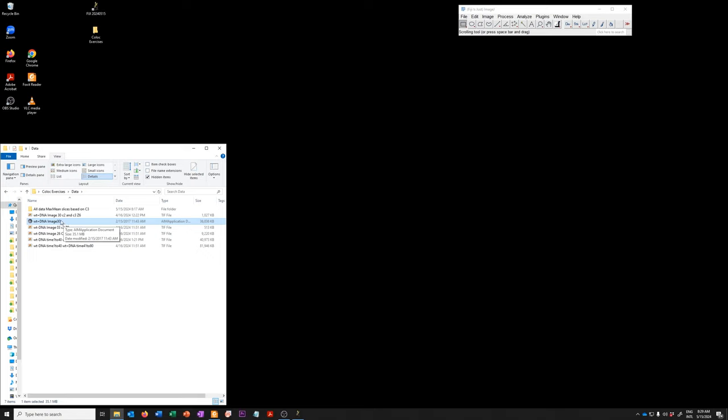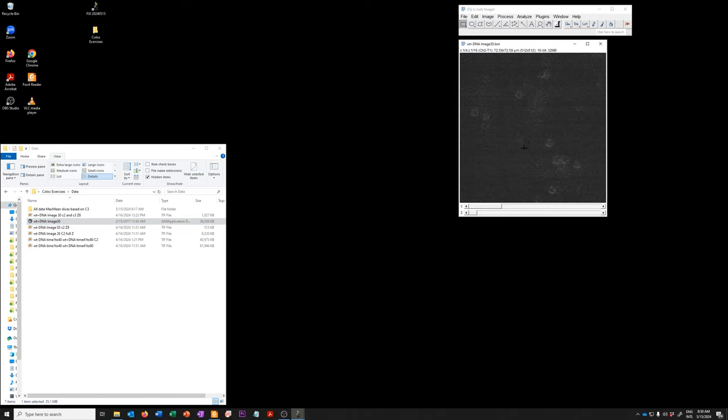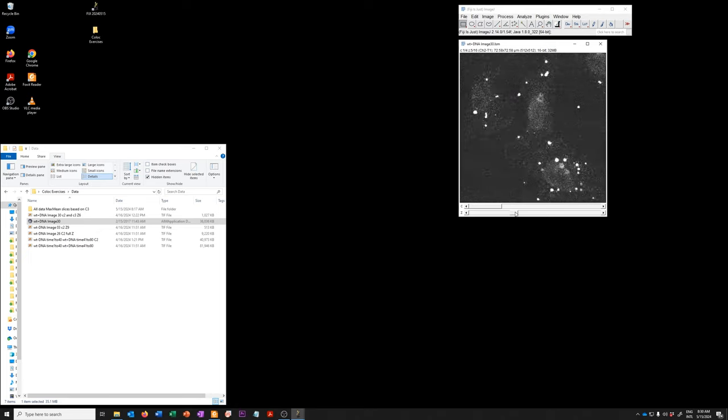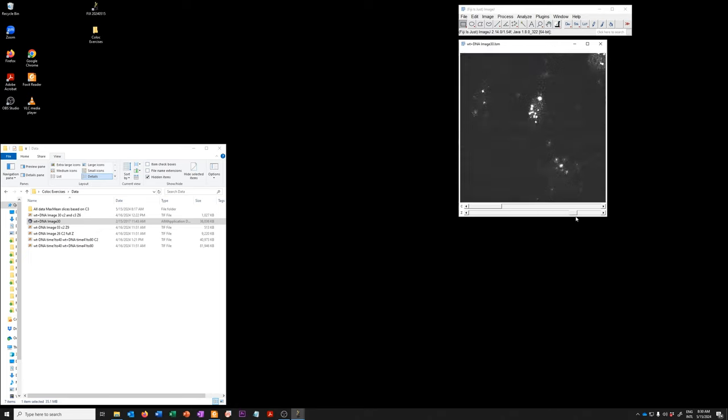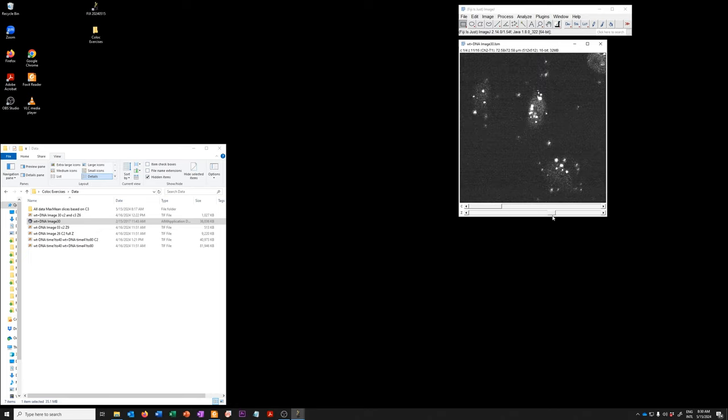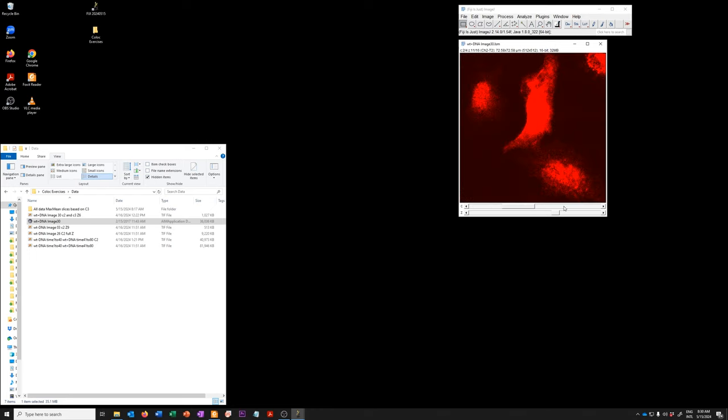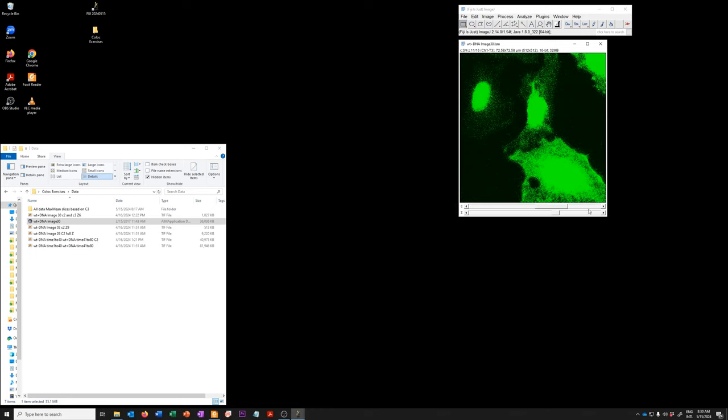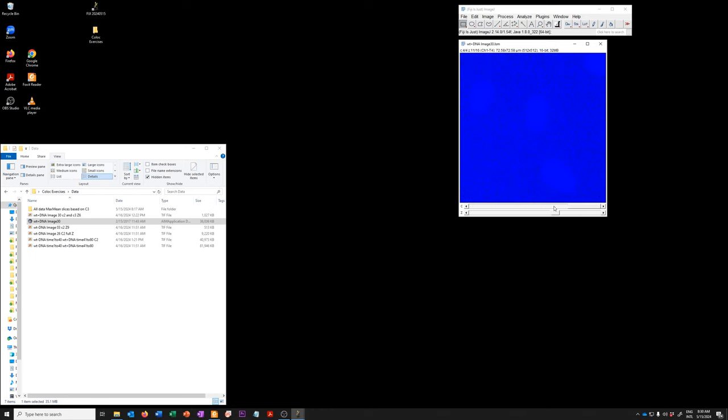We can just drag this to Fiji and it will open. This is a hyperstack with four channels and 16 Z planes. These are the Z planes in one of the channels. This is another channel, another one, and another one.